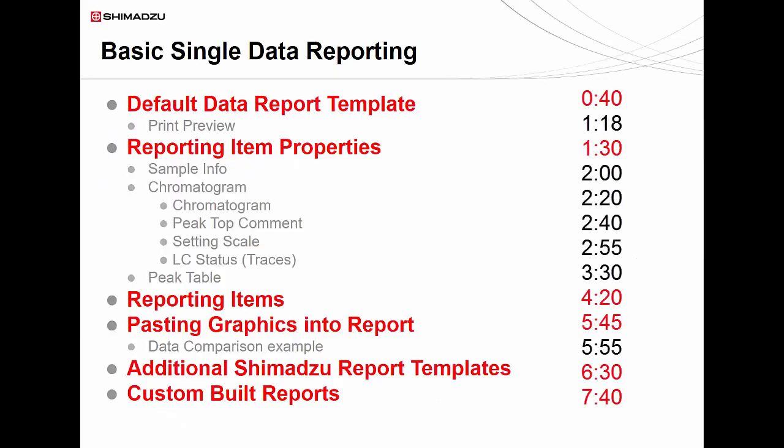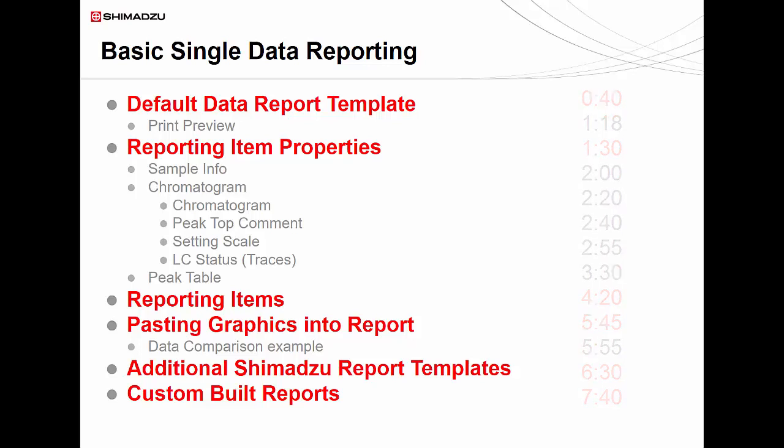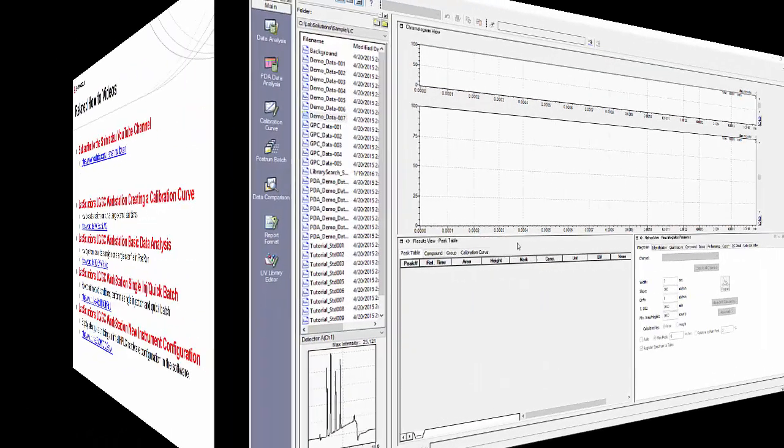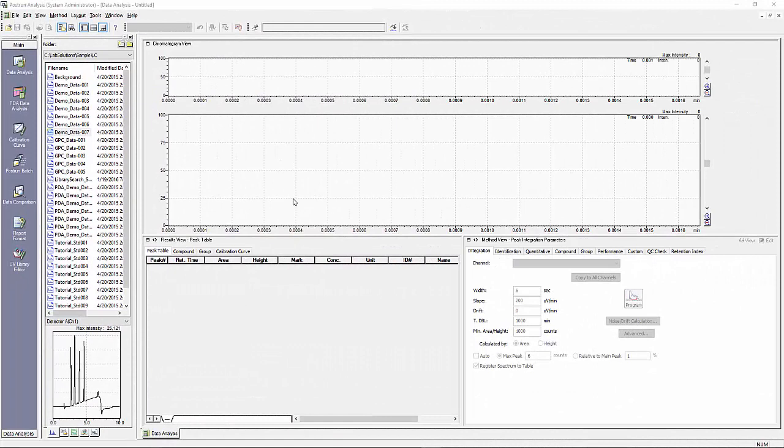In our previous videos we discussed how to acquire, quantitate, and analyze data. Now we have a finalized data file that we want to report on. In this video guide we will go over how to use the basic reporting options within LabSolutions software to generate a report highlighting any aspects of the data you acquired.